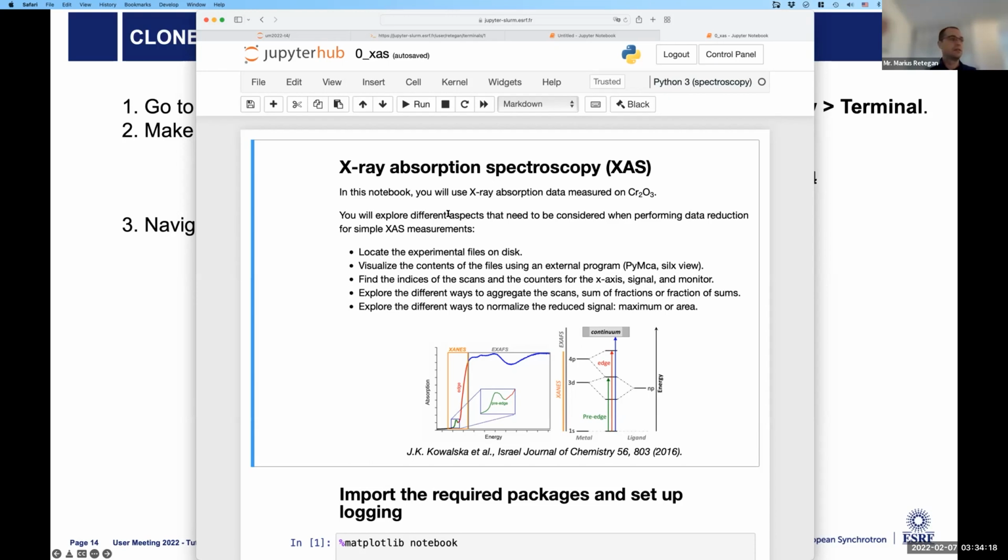But we have the issue that it doesn't work at all. Yeah, that can be solved. In principle, it shouldn't be an issue. But I don't know what's happening. It's something related to the network file server, NFS, that didn't work on Friday, and we are crossing our fingers that it will work on Monday. But apparently, it doesn't work for everybody. So that's an unfortunate event for sure. Sorry to interrupt you. No, but I understand it can be frustrating when things don't go as expected.